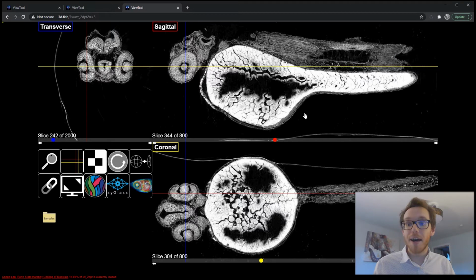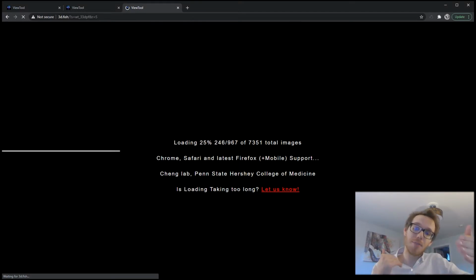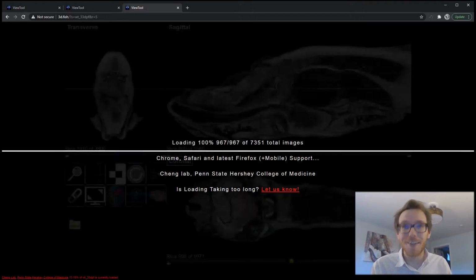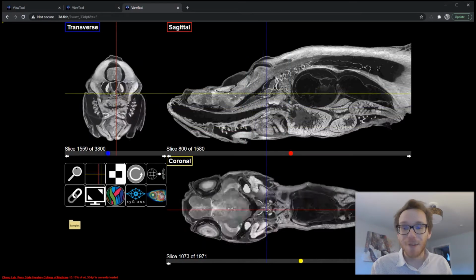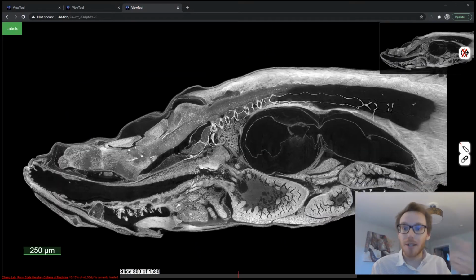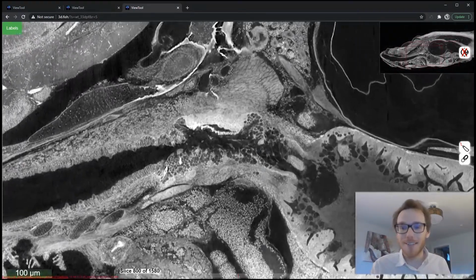I'm going to load that 33-day sample that you saw the video of earlier when it dove into the gills with the 2 cut planes pulling apart. This one takes a little bit longer to load because the images are a bit bigger, but we're talking about 13 megabytes per sample if they're large, which is a far more realistic scenario than the 32 gigabytes. This fish itself was about 100 gigabytes before we put it in here, and I believe it is 15 megabytes to sort of initiate this viewer.